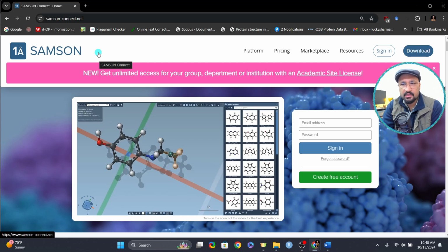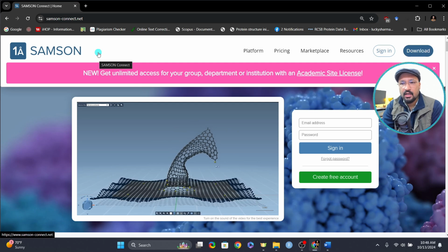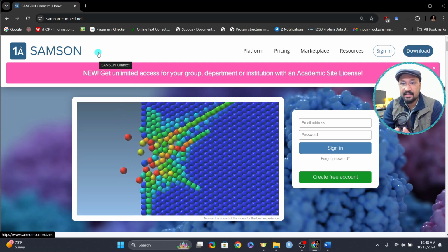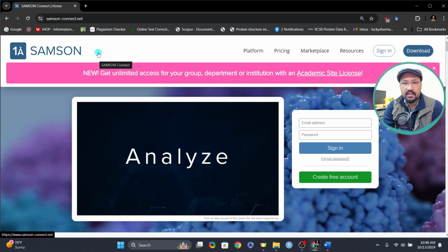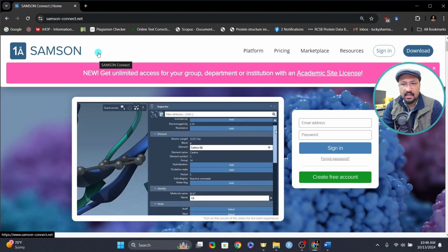After we visit the entire website of SAMSON, we'll move on to the actual SAMSON tutorial part, where I'll be showing you just a taste of SAMSON, how you can see a compound, and how you can do basic visualization. In future, I'll be making more videos on specific parts of SAMSON, because that is how we're going to learn.